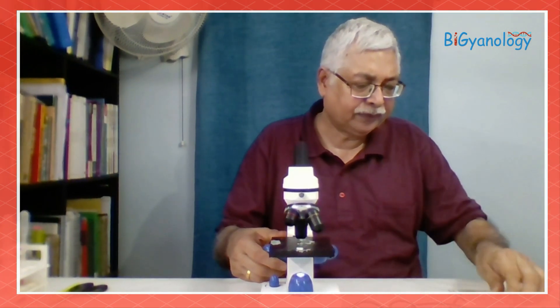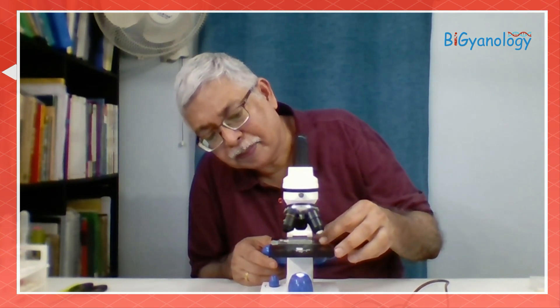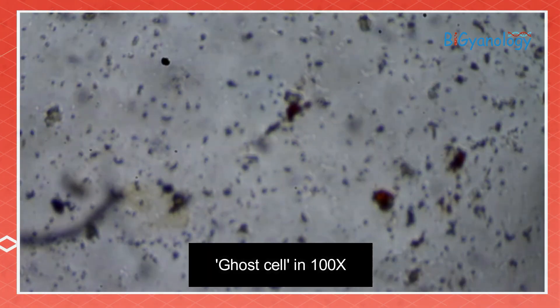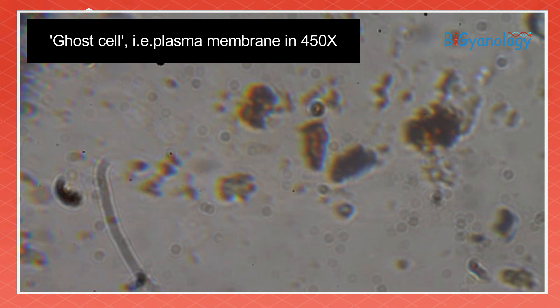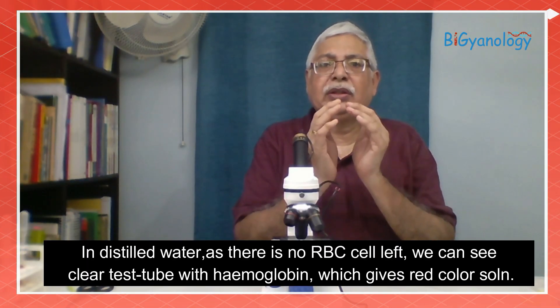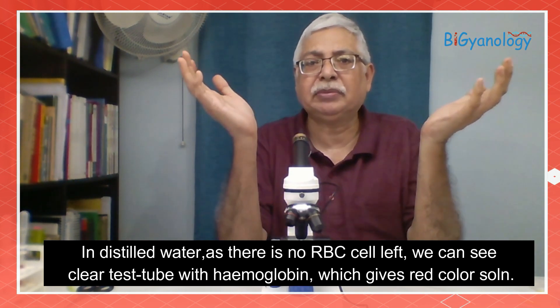I am removing this one now and putting the distilled water slide. We cannot see any RBC because RBC is no longer intact — if it has burst we just have the membrane, the ghost cell. In high power, these are just the membranes — we call them ghost cells. Because of distilled water, water entered and since this is an animal cell, the RBC has no cell wall, so water keeps on entering, the cell membrane keeps on expanding and it bursts, and so we can see only ghost cells.